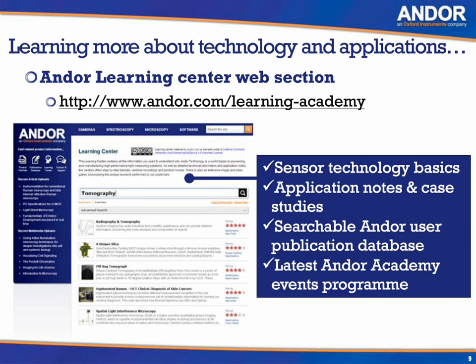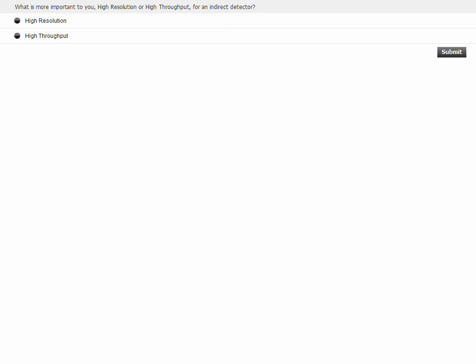So to finish off, what I would like to do is ask another question, following on from Yuri, to get a feel for where you sit. If we could put the poll question up. It's an interesting conversation from our point of view. What is more important to you? Would it be high resolution? Should we be looking to improve resolution? Or is it high throughput for an indirect detector, something that's using scintillators to convert into the detector system, as we've seen? We're just getting a feel. What do you feel will be more important, high resolution or high throughput? As Yuri said, if we could take 30 seconds to think about it, and we'll gather that information. It's trying to make it a bit binary, but hopefully there are some strong preferences, and we'll see where the majority of you feel the improvement would lie.